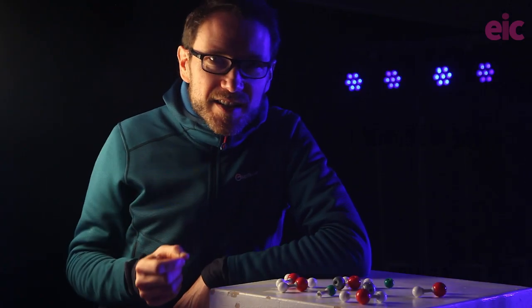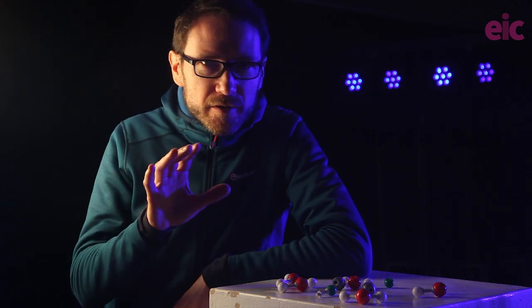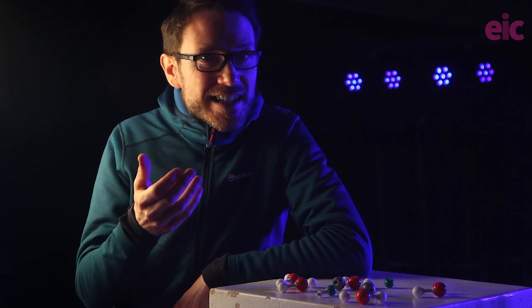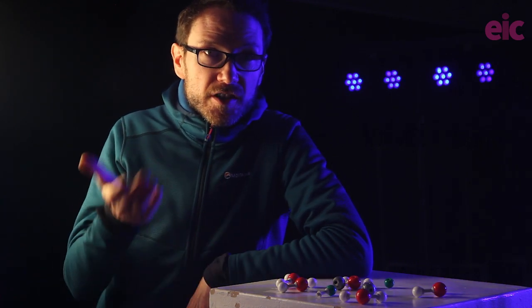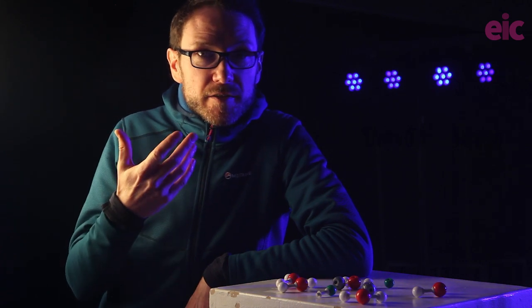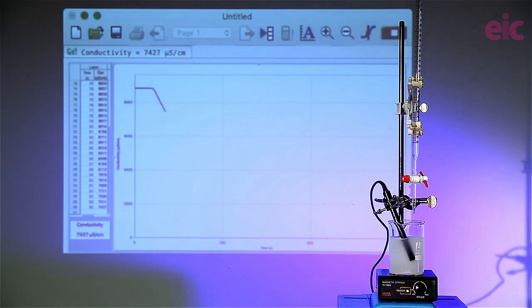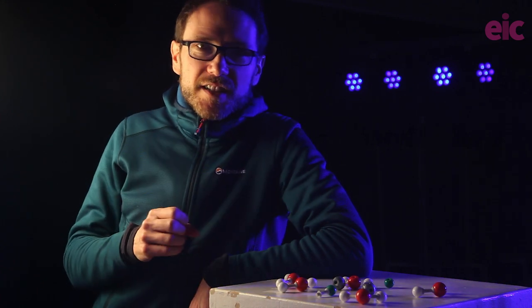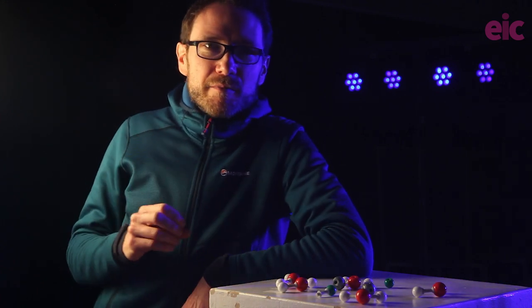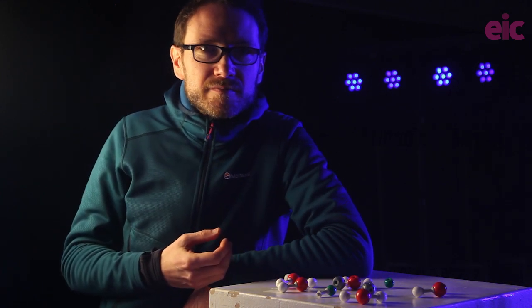Last time on Exhibition Chemistry, we were left with some unfinished business. We were able to get as much nuance as was needed from a neutralisation reaction to help students visualise the ionic equation in action, following the disappearing ions with a conductivity probe. Today, we're going to do a deep dive on strong and weak acids and see just how much a conductivity graph can reveal to us about the makeup of solutions at different stages of the reaction.